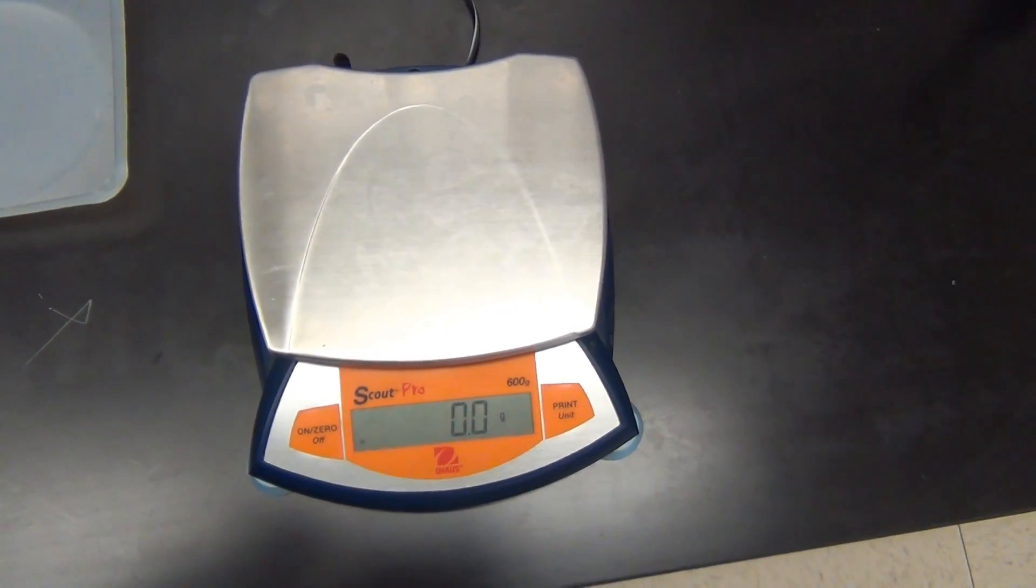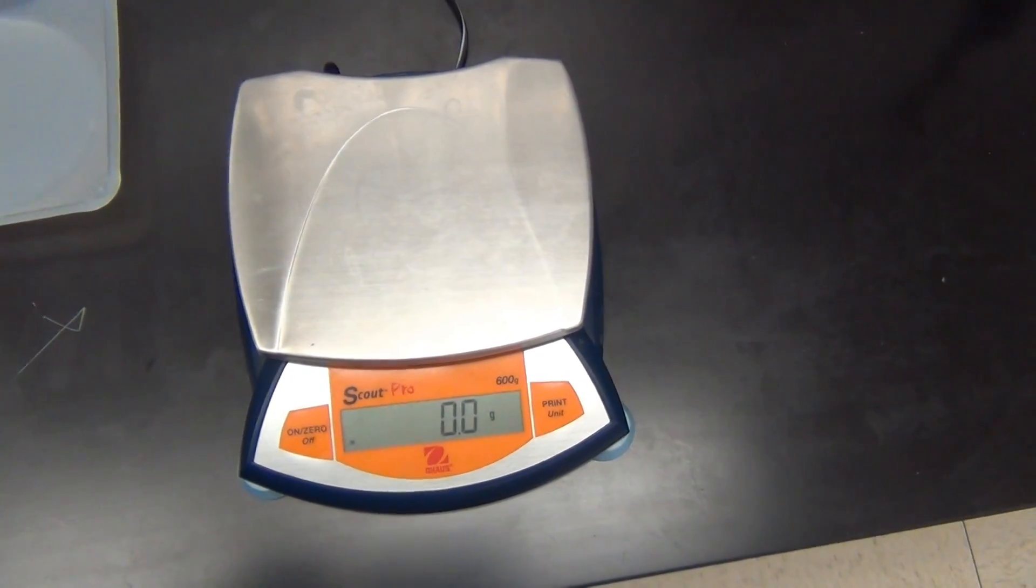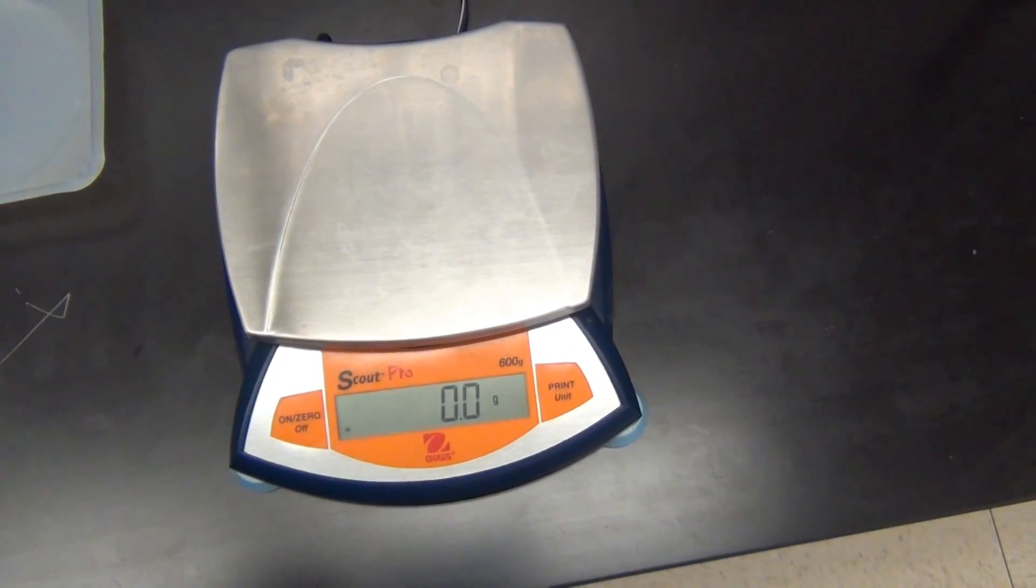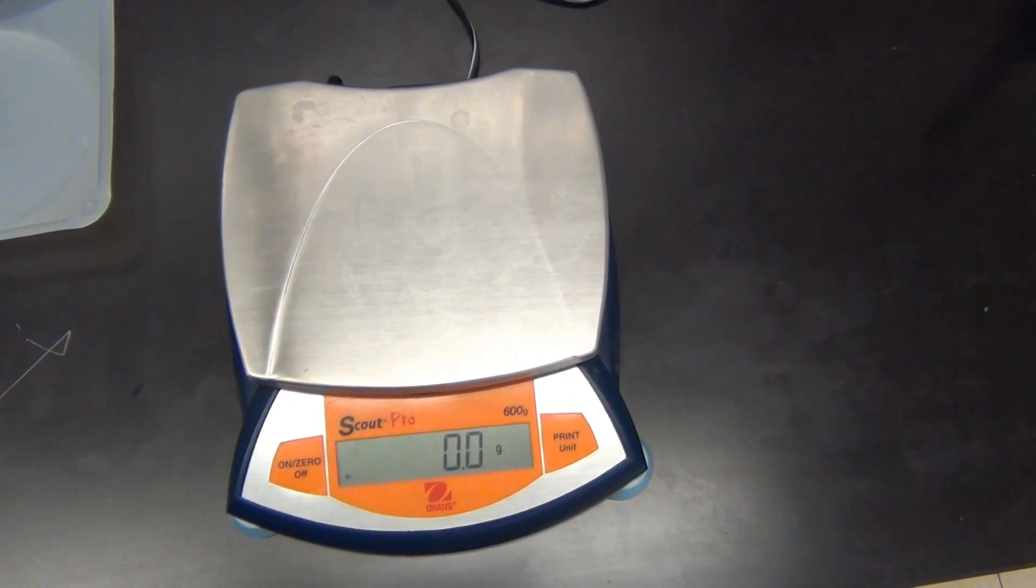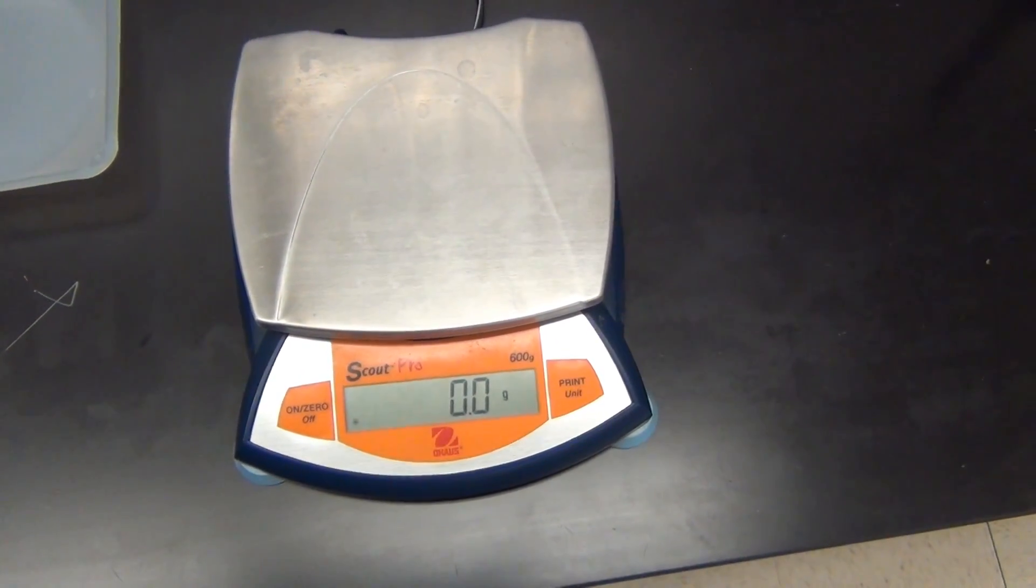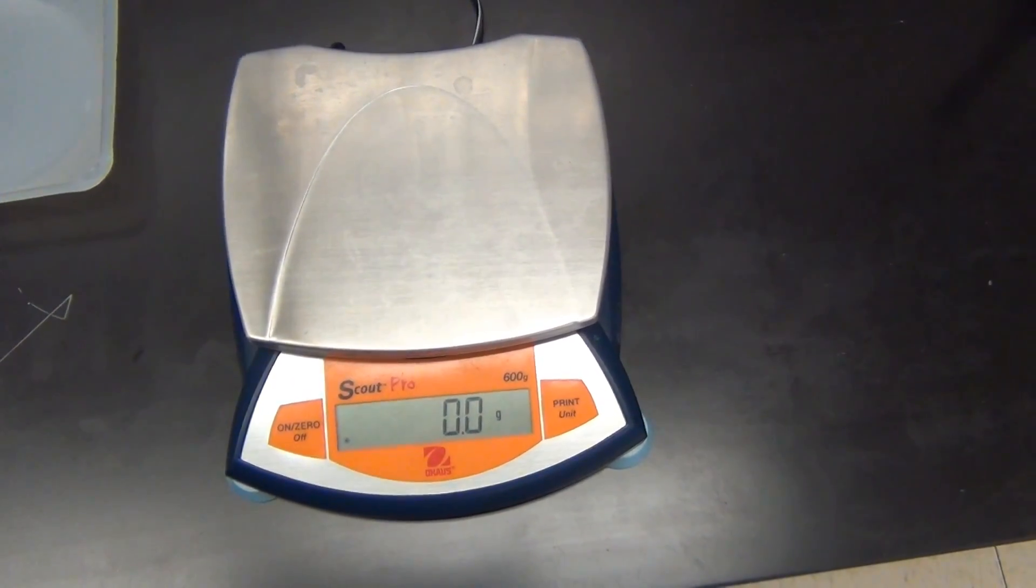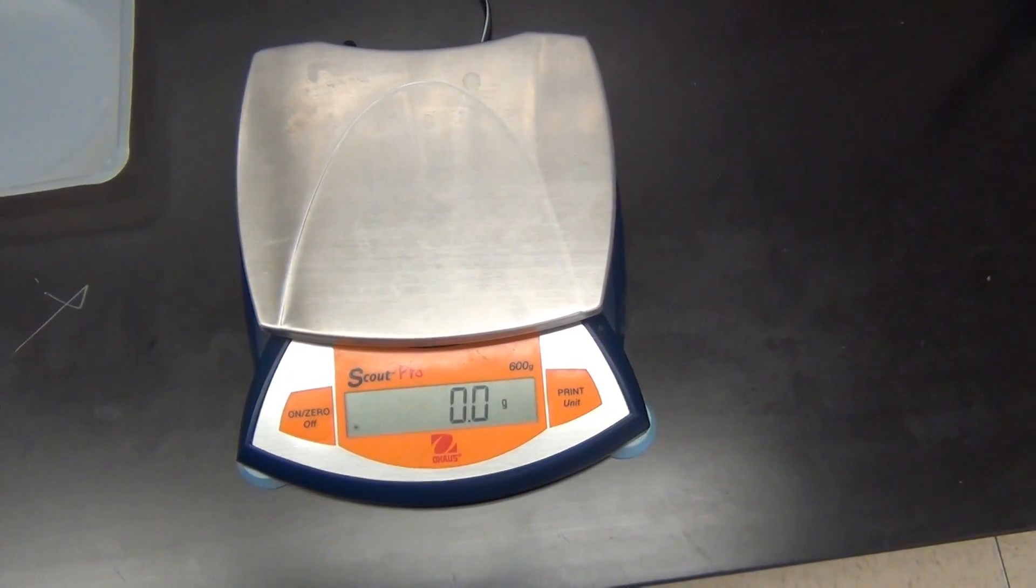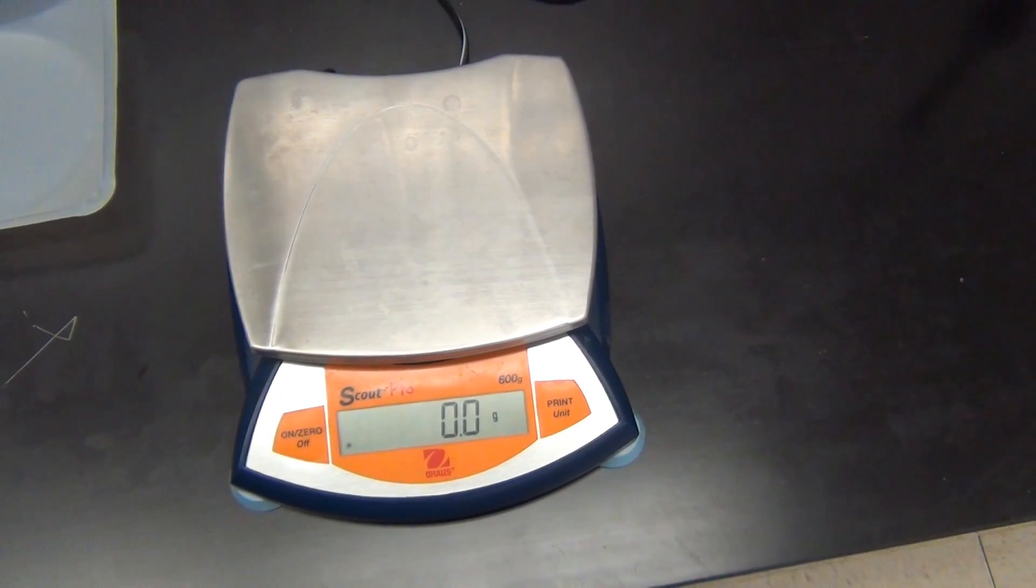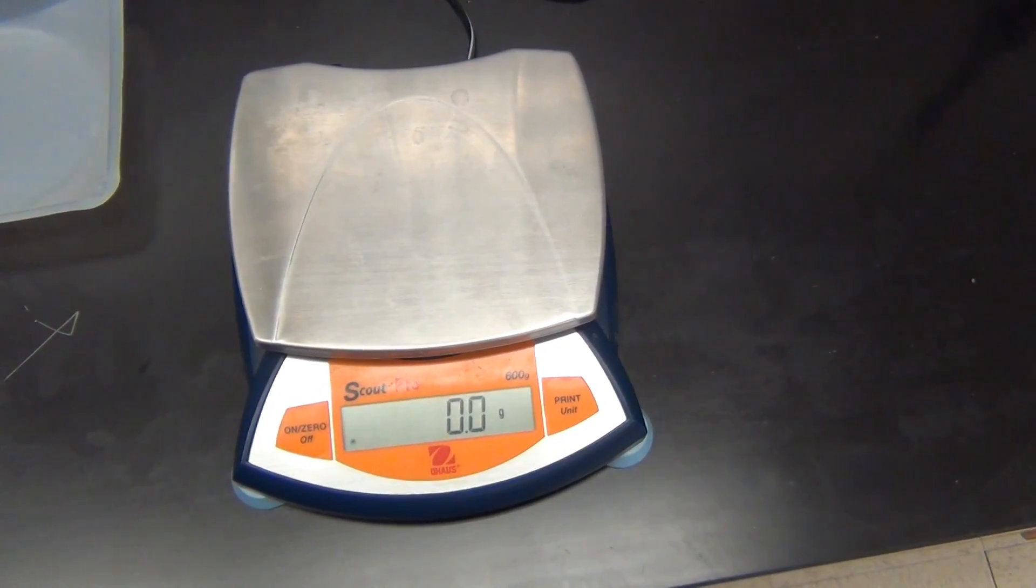First, let's look at the top loading balance. It's a balance that is accurate to the nearest one tenth of a gram. It is used in honors and CP level classes as well as at the AP level. It's a good purpose general balance valued at about 250 dollars.